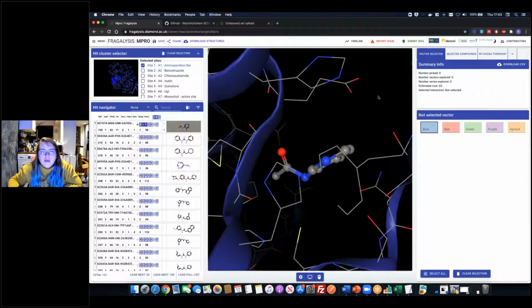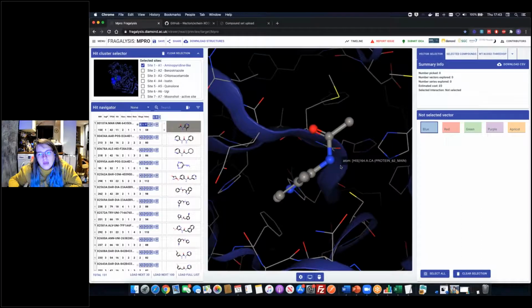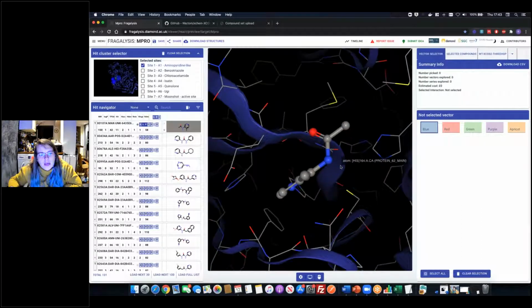So I think, through most of this demonstration, we've focused on having this reference protein. And probably at that point, you'd want to turn on the actual protein structure, right? So when you upload the SDF file, you can upload a zip file of PDB files as well. And if the PDB file is one that you're uploading, you just specify that in the SDF block. Okay, that sounds good. Yeah, and then that would solve that problem. So you can look at those differences.